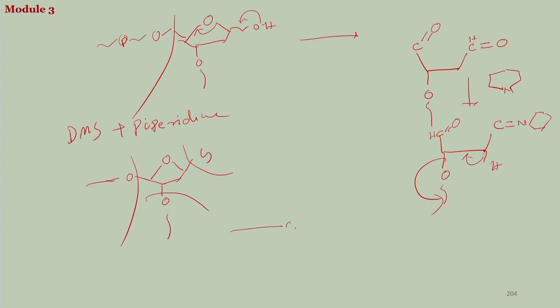If you have a DNA with G and you treat it with DMS plus piperidine, what essentially it does, it will cleave this off. You will get a fragment this plus a fragment this. Now, we have started with the P32 labeling here. Therefore, this fragment will have the label, this fragment does not have the label and we will not be able to visualize it.